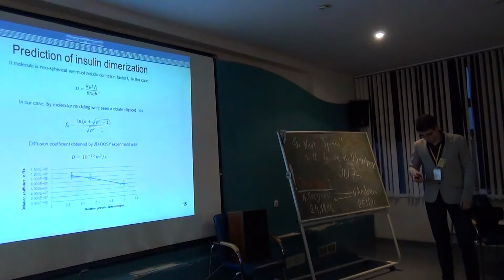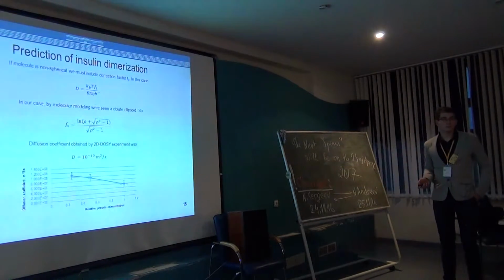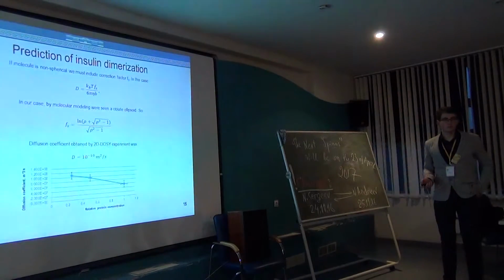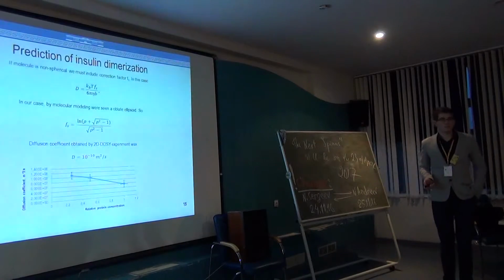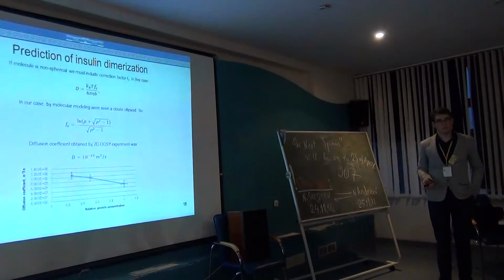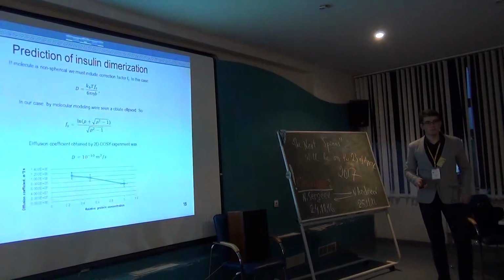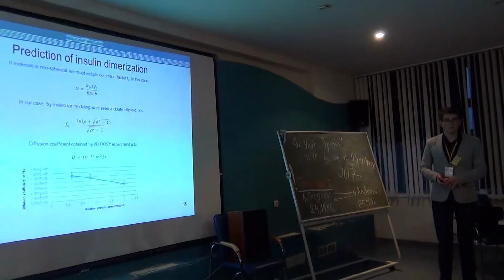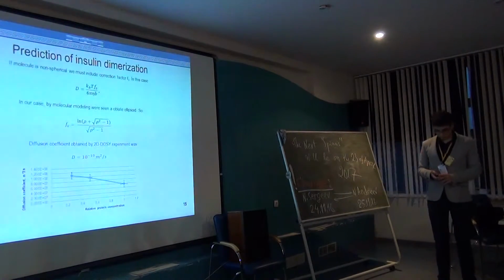And the second question, if you have some oligomerization, probably you have not only one type of oligomer, for example 10-mers. It seems that you have some distribution of them, and if you have such a distribution, this could lead to different structures. How is this inhomogeneity reflected in the quality of your obtained structure?